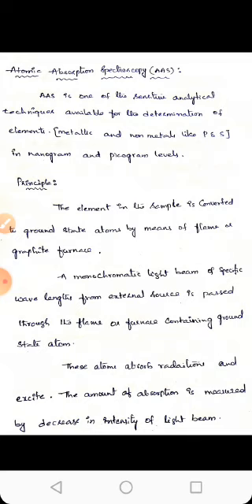The amount of absorption is measured by the decrease in intensity of the light beam. The amount of absorption depends on the number of ground state atoms. If the number of ground state atoms is high, the absorption of light is also high, and in turn it depends on the concentration of the element in the sample.